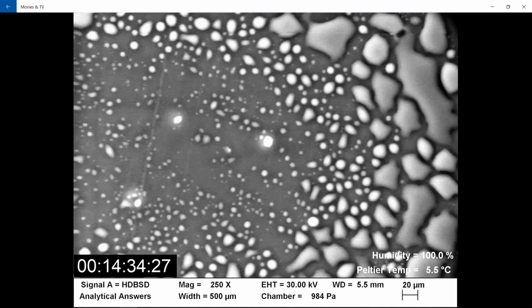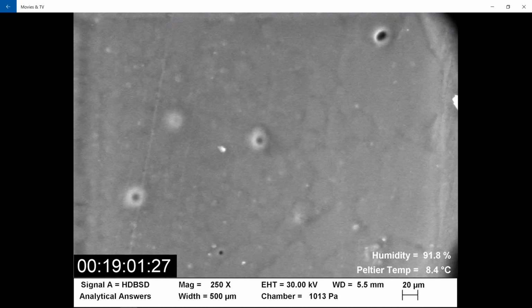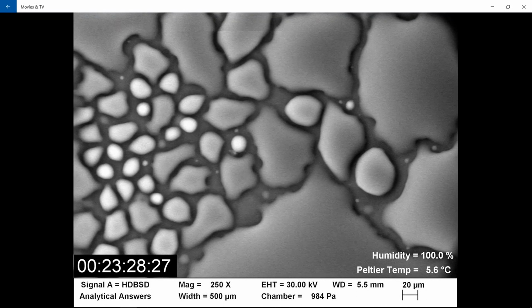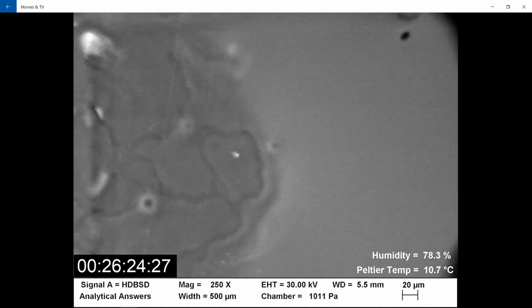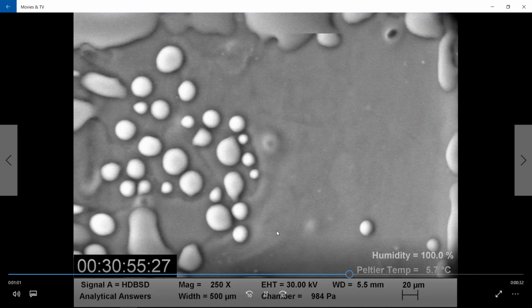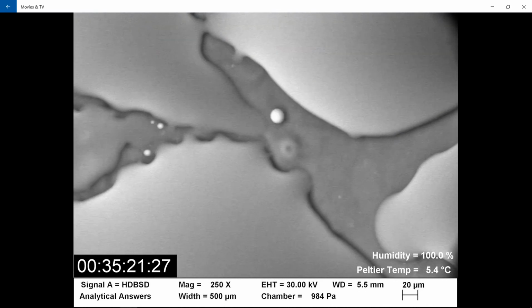Now we start to see some droplets on the surface, and you can see that they wet the sample in a very specific pattern because they do not wet it uniformly. That could be a result of differences in material homogeneity, or a surface treatment which makes the water not wet it uniformly. Those types of features can be examined using other methodologies like imaging FTIR. Again, we see patterns that are preserved in the surface of the material after each successive wetting cycle. For this last cycle, we're at the 33-minute mark of real time, even though we're only about a minute into this video.